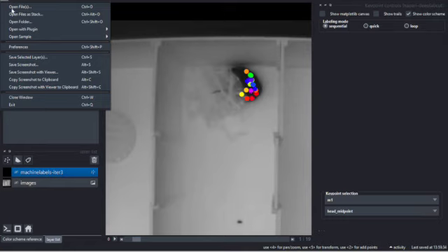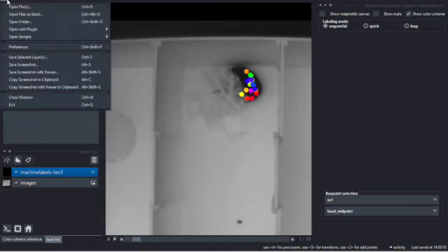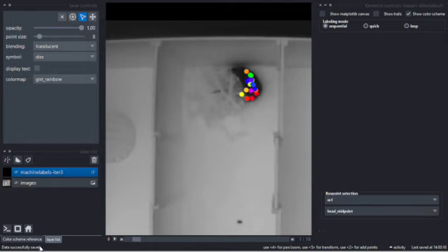Make sure that when you do go to Save Selected Layers, you see it for a very quick second in the bottom toolbar, that data successfully saved. So make sure that you are seeing that, because sometimes Napari will freeze and you won't realize, and it won't save the data. And so if you have a lot of frames to go through, this becomes a problem.